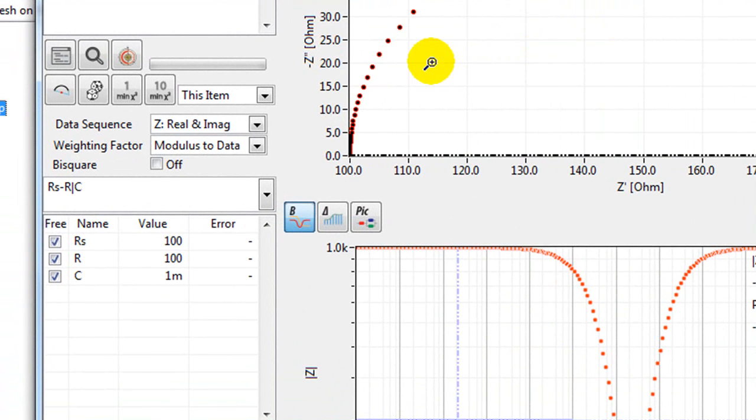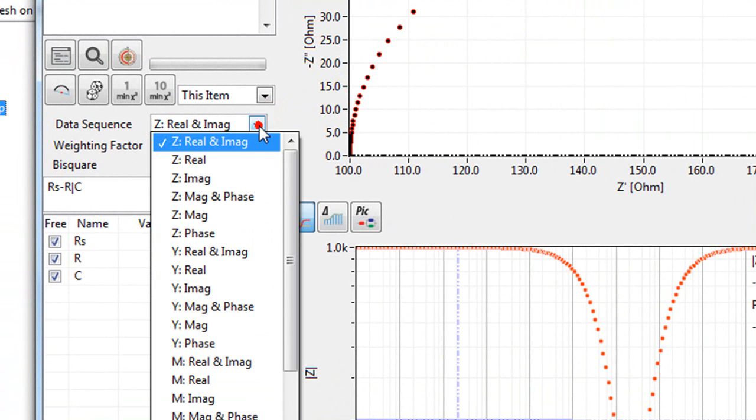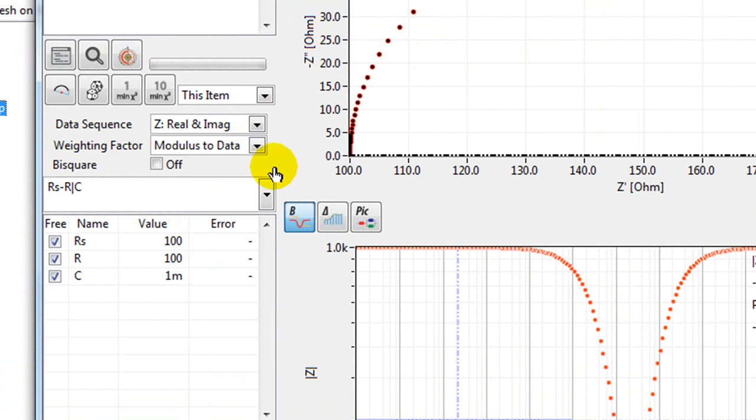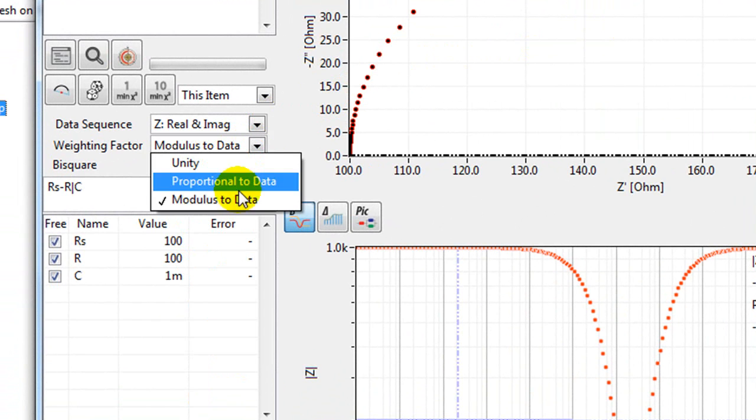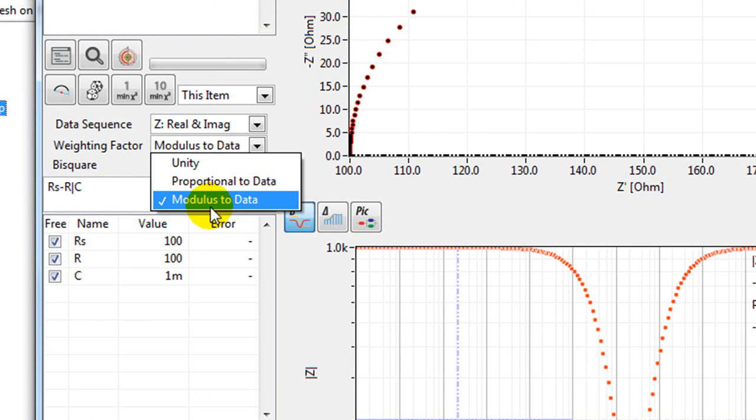You can now select the data sequence for the analysis. The default is real and imaginary impedance. You should also choose the weighting factor. The default for this is modulus to data.